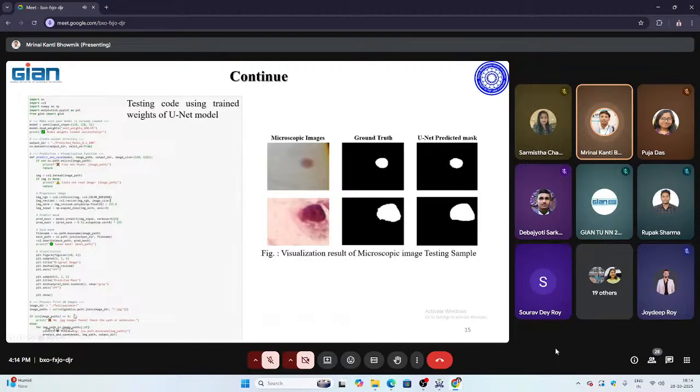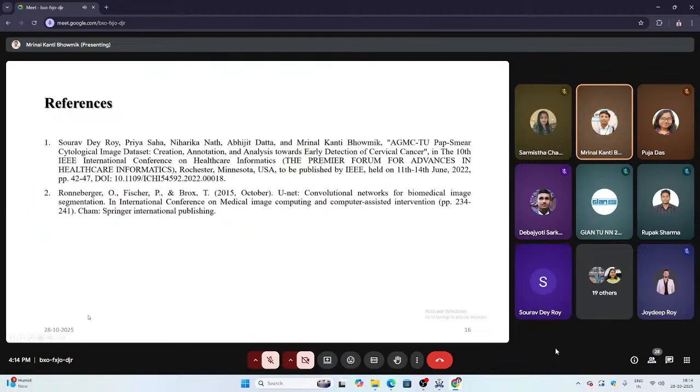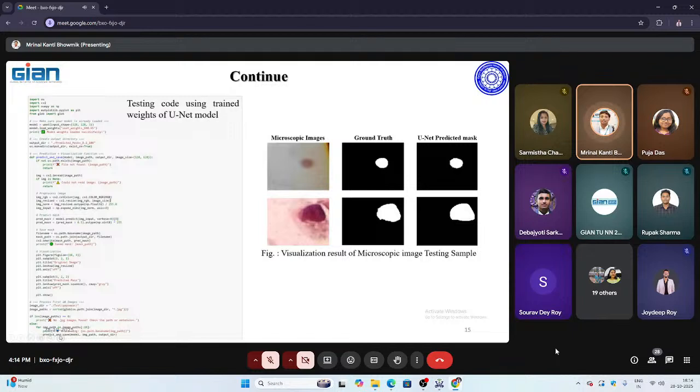First of all I have to save it. If the image path has JPG images found, image range 20, yes, I have considered 0 to 21. That's why the range is 20, and in that particular name, due to the date, it has not been shown.